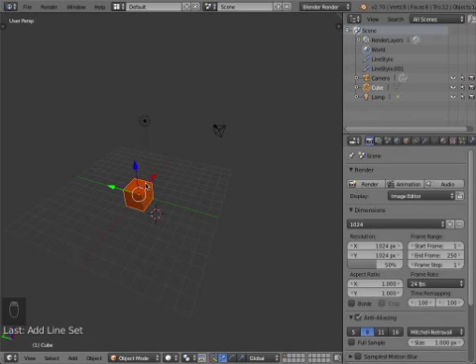If you calculate something from the mesh, you always need to work with triangles, which means you need to triangulate the quadrilaterals, and they can always be triangulated in two different ways, and we can't have this ambiguity. That's why we always need to be sure that everything is completely triangulated.